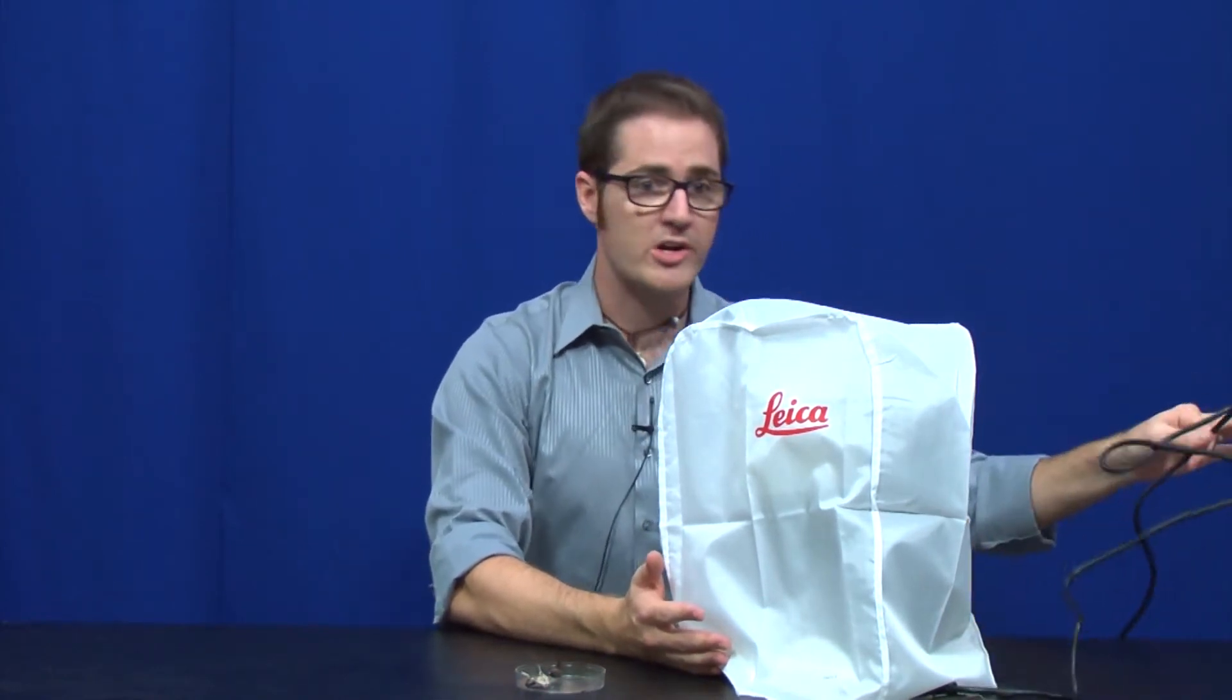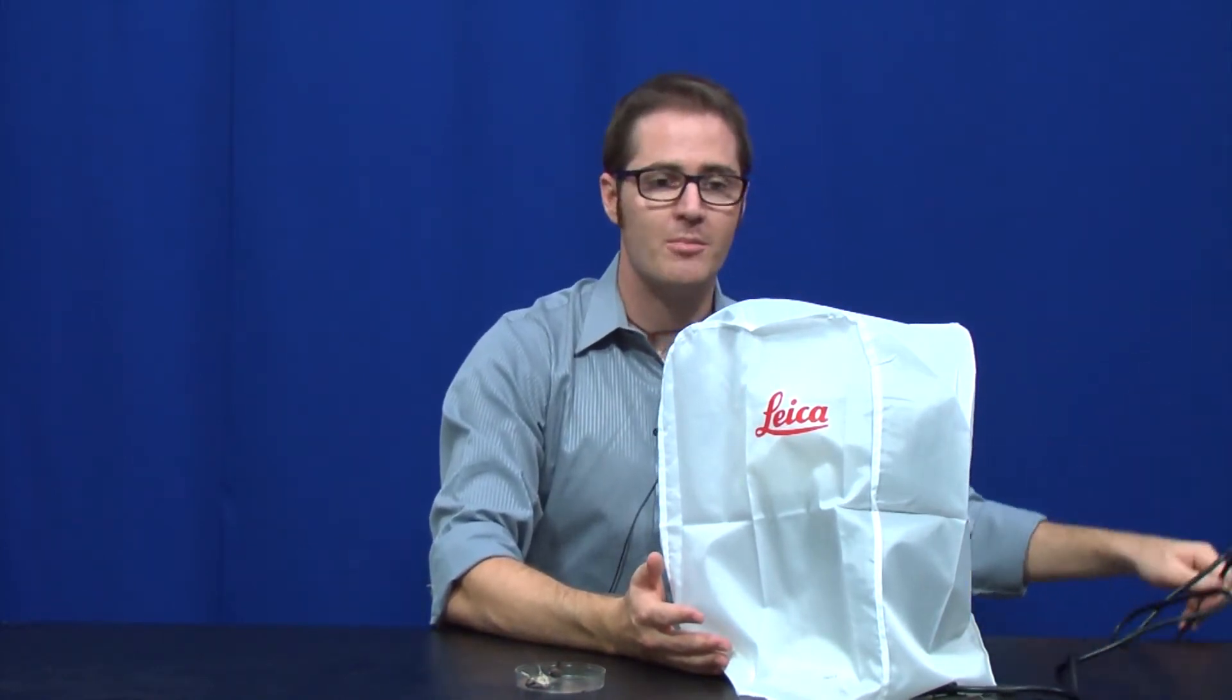I have the stereo microscope here. This is what it's going to look like when you pull it out of the cabinet. It's going to have the dust cover on. This cord will actually be wrapped up. I've already plugged it in down below the table here.